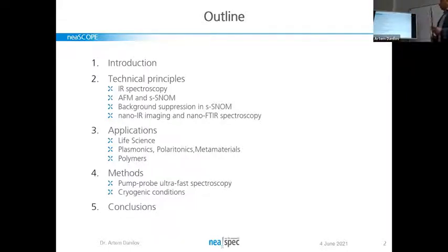tell what we will be talking about today. I'm going to introduce briefly the company and the background of what I'm going to talk about today. I will go into more detail, because all of you are probably experts in near-field optics more or less, or metamaterials, so I will concentrate a little on the technical aspects of the technology which we're doing. Then I will move on to applications in some scientific areas where our users are implementing this technology. So this is the overview of what our users have done with it. And then I also have a few words about quite interesting combinations or developments which can be done with this instrument.